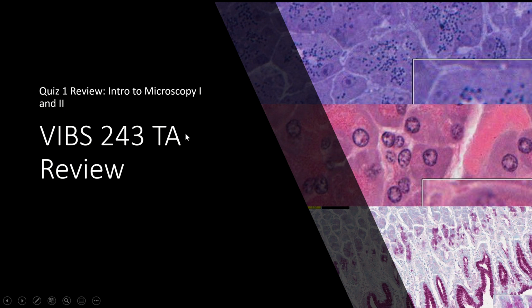And I'm going to be hitting the main points in a summary version in this TA review. So hopefully that makes sense, but basically, don't get stressed out when he starts pointing out all of these cells, all the different white blood cells, all the different organs, and what they all do. Right now we're mainly focused on introducing you to microscopy, so understanding how cells and tissues are stained and how we can observe them is going to be our main focus for this week.